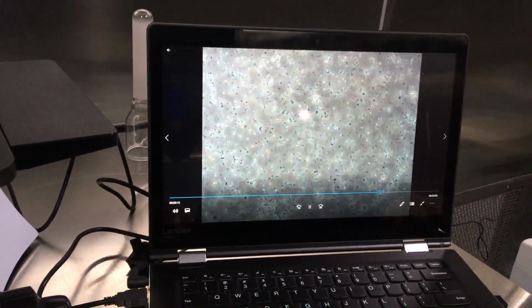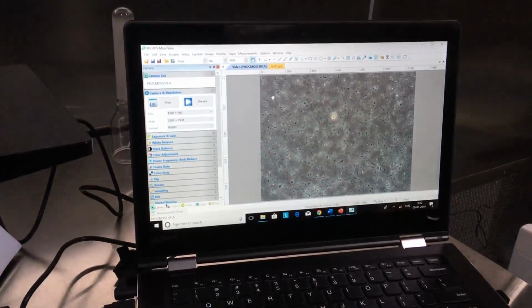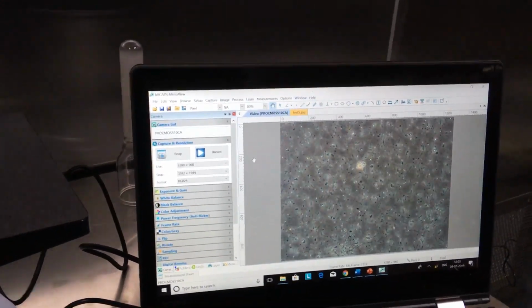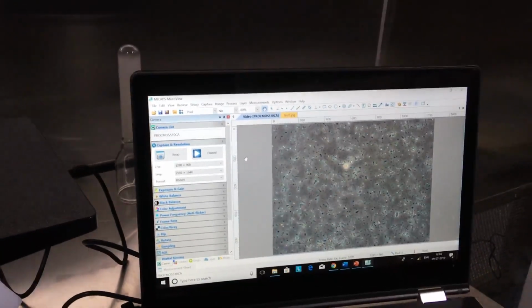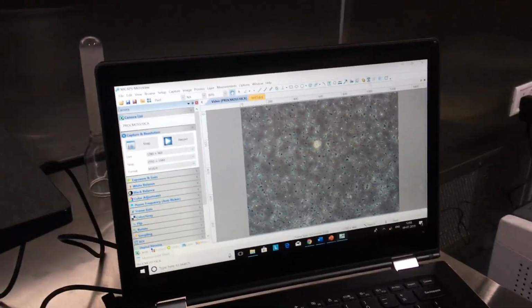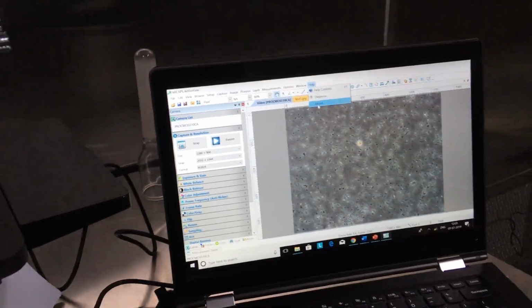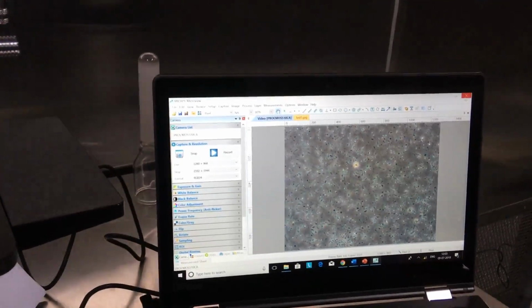So you can close, and then I'll go to this one. There are a lot of options, you can see file, edit, view, browse, setup, capture. So mostly you can set these at once for the standard settings, and if something is required, you can just play around without disturbing the settings. So now help about is the software version and all, here it will show. So then once it is done, you are done and close.